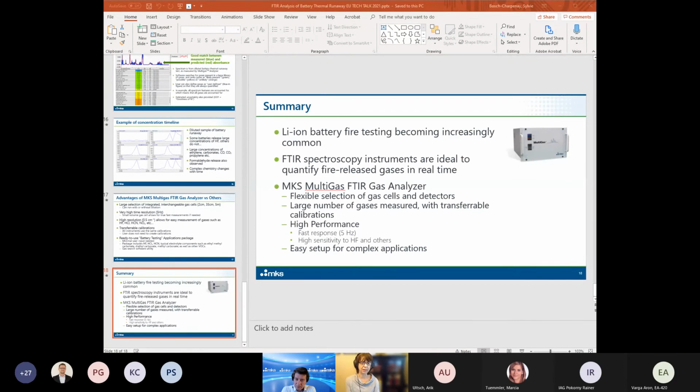The main one that we've had trouble with is sulfuric acid, H2SO4, and that one is very tricky, because if there is a little bit of water, it's a complicated chemistry.